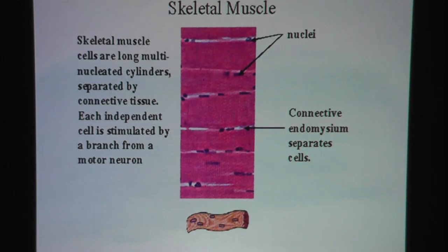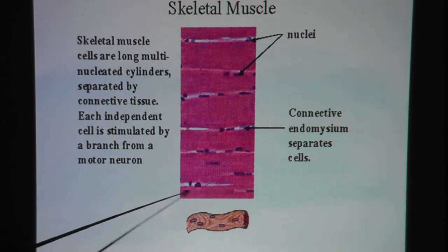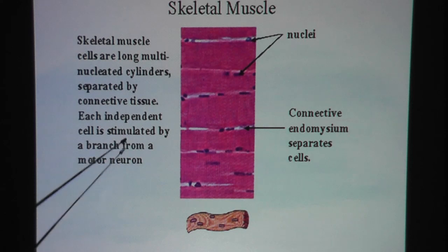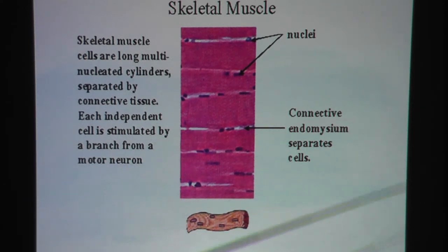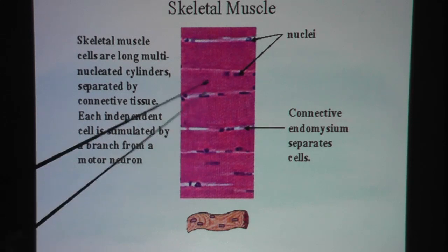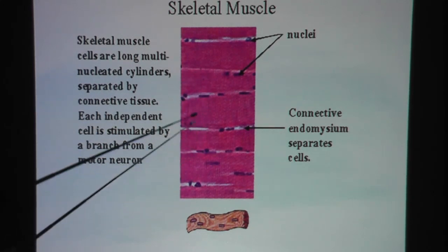Here you have another glimpse of skeletal muscle tissue. As you can see, these are long muscle fibers that run parallel to each other. Perpendicular to the length of the muscle fibers are the striations — these stripes.